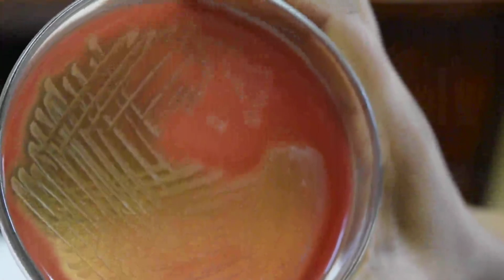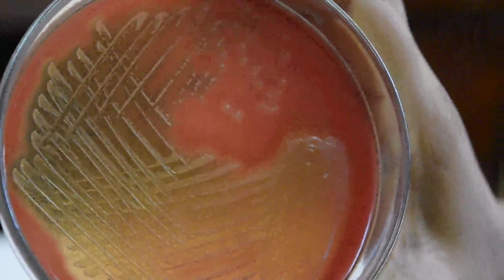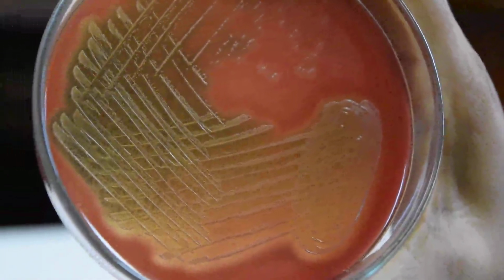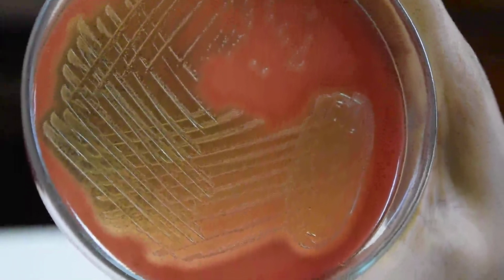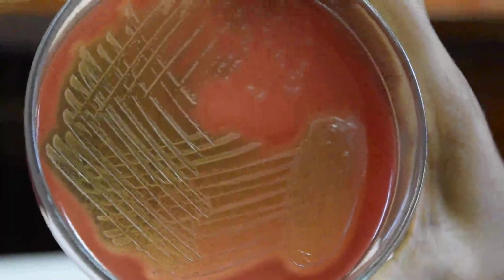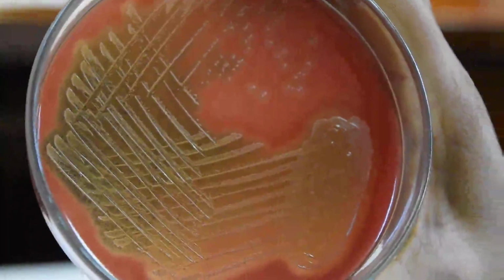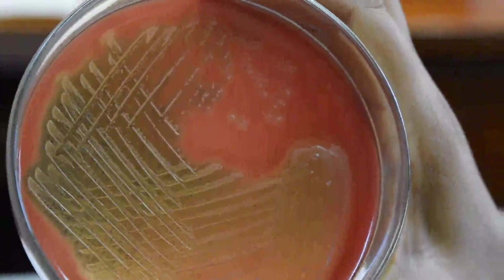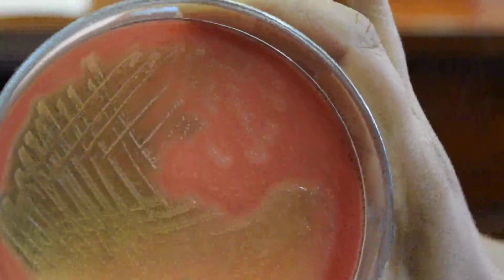What are the examples of beta hemolysis in different streptococci? That is group A streptococci, group B streptococci, and C and G streptococci. Those Lancefield groups of streptococci A, B, C and G all show beta hemolysis around the colonies. Here you can see it's a wide zone of beta hemolysis.